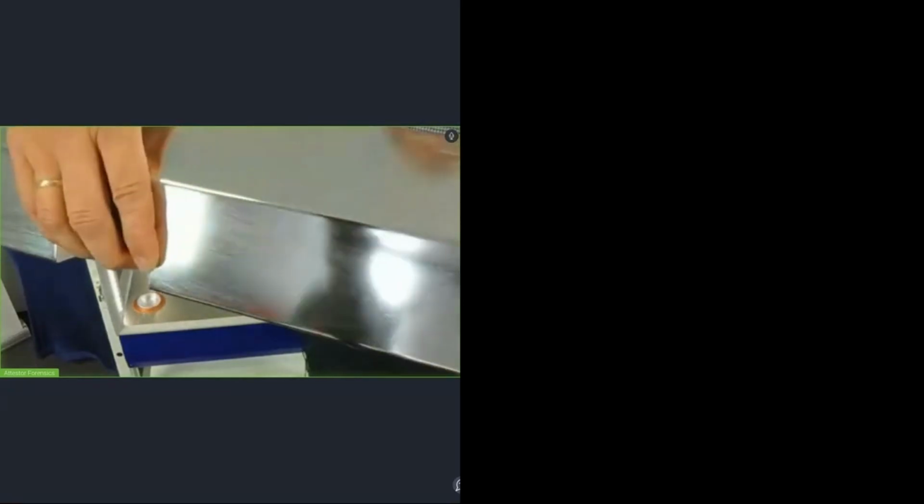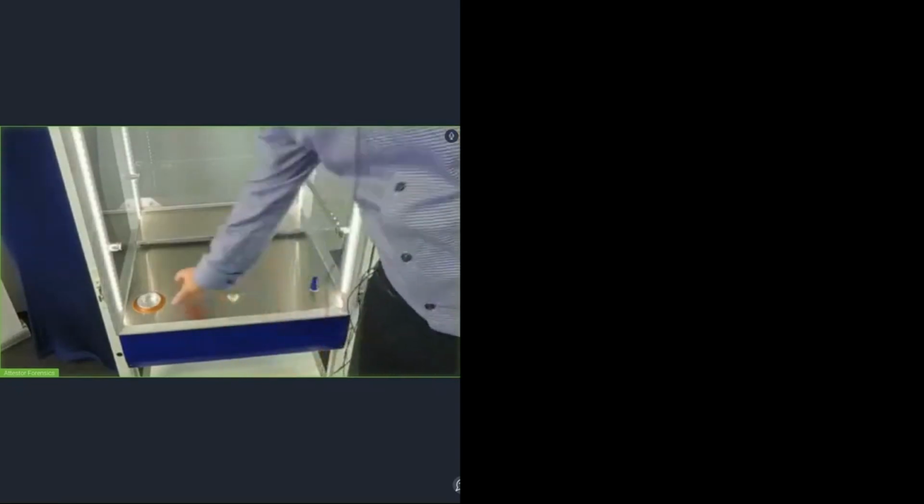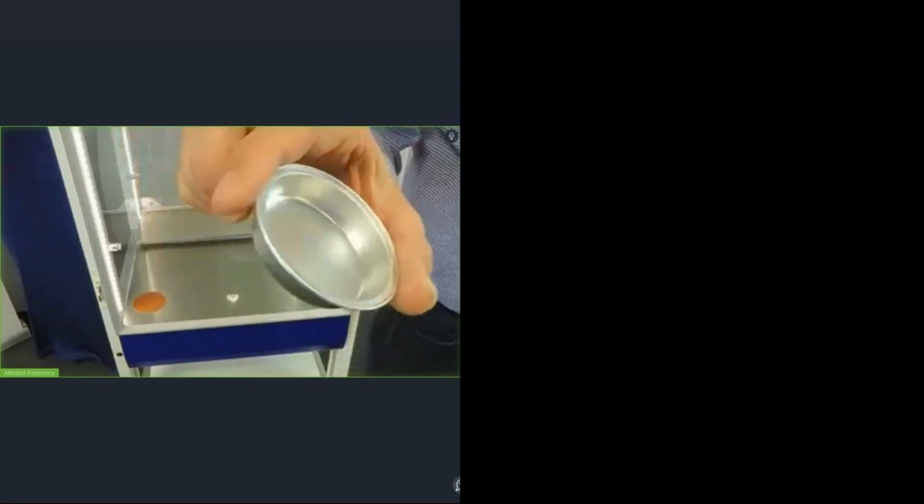Also, that one is polished, electro-polished stainless steel. That's not even cleaned. That's directly after some fumings. You can probably see a bit of that residue on there. And again, that one also goes into my dishwasher. I don't have a lab dishwasher. I use the standard dishwasher in our canteen for that, just a very hot program. Works quite nicely. And that's the type of dishes we use, but you can use whatever you think.